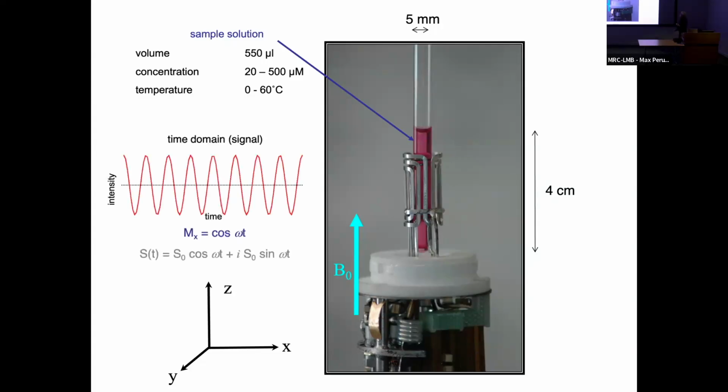Now, the coil, somewhere, there we go. The coil is set up to detect magnetization that is precessing, rotating around from these individual nuclei. They all co-align and they produce a net magnetic moment that is measurable in the receiver coil. Okay, so at equilibrium, that magnetic vector is pointing straight up the bore of the tube, and we can't detect anything right inside the coil.